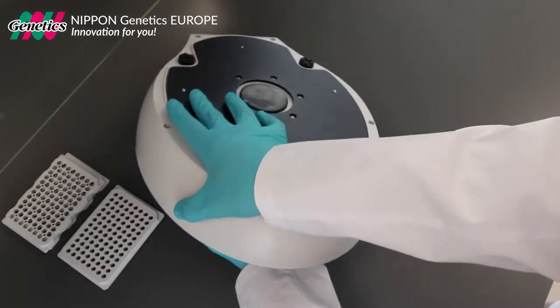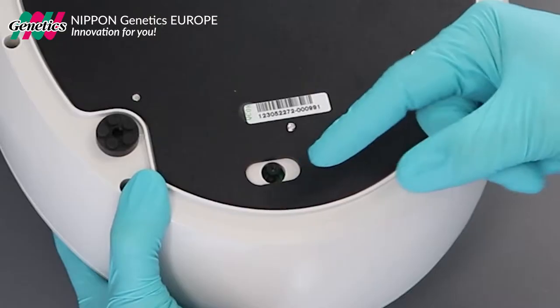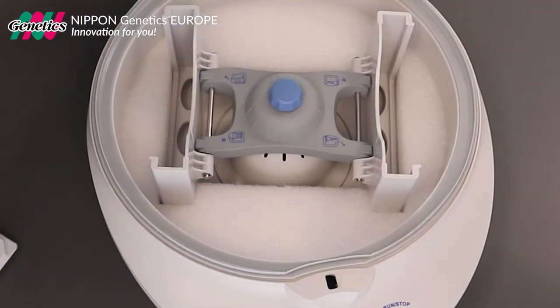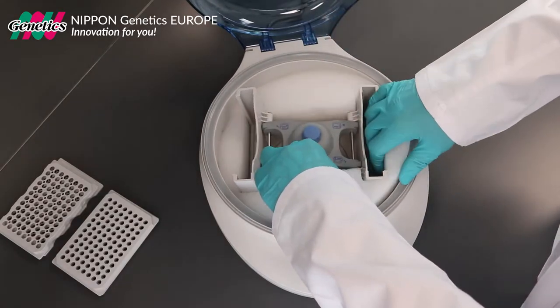When unpacking the plate centrifuge for the first time, pull the manual lock that is positioned at the bottom of the centrifuge. This allows the opening of the lid. Carefully remove the safety plastic from the inside of the centrifuge.